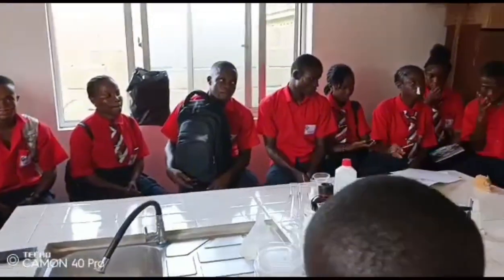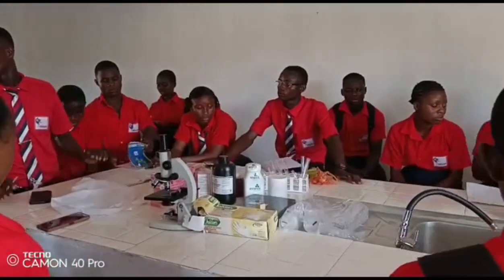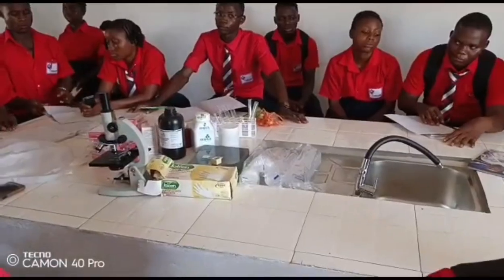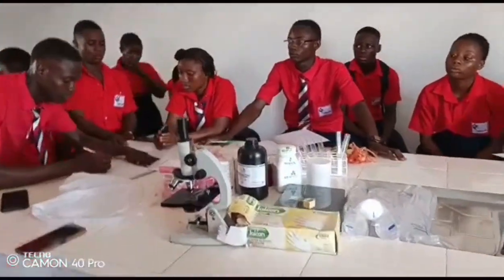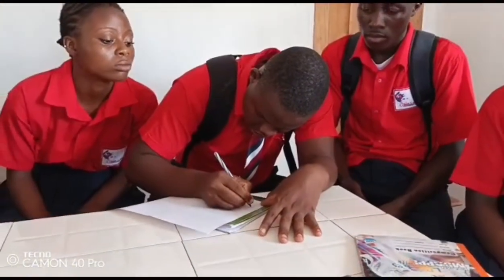Materials required. Put the materials, meaning the materials we're going to be using for this experiment. Read the materials.